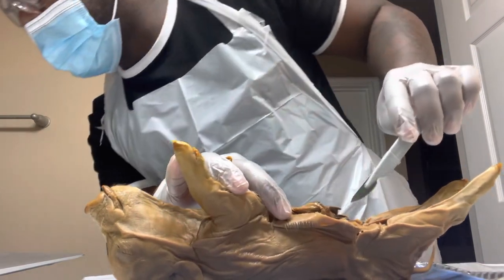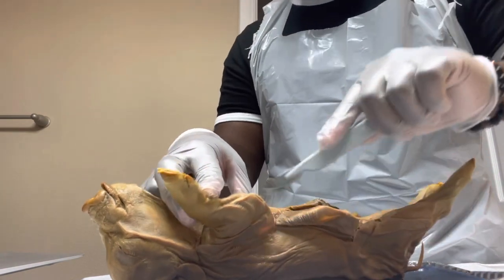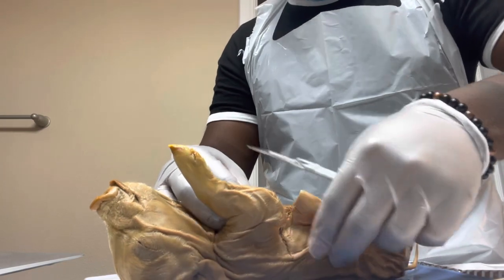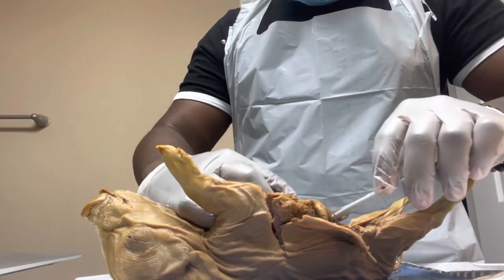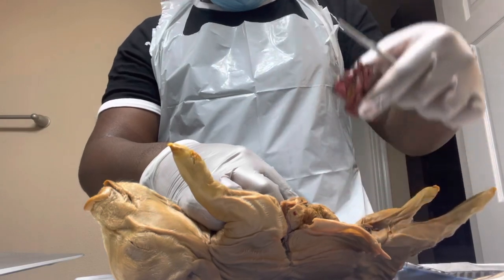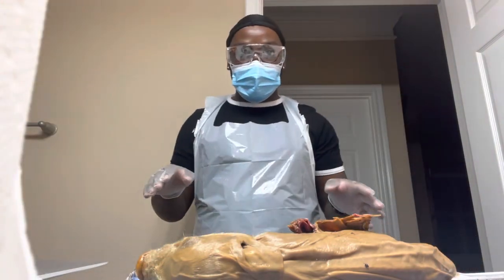Lord, I don't know what I'm looking at. Okay, Justin, you're going to have to cut him some more. Oh, I just don't want to. I feel like I'm tearing him up. What is this? Oh, his heart. Ooh, what is this? Ooh. Thank God for an apron. I am removing, I think it's his intestines. Okay, I do think that I am complete.